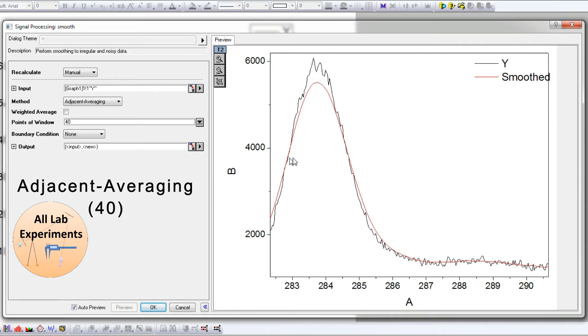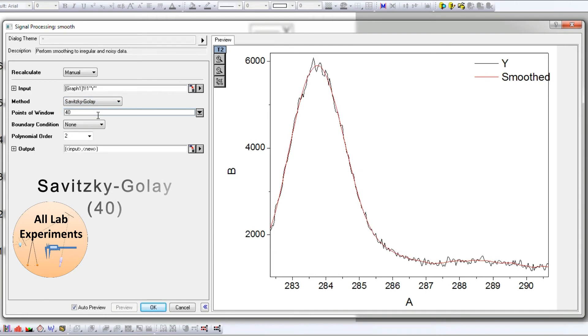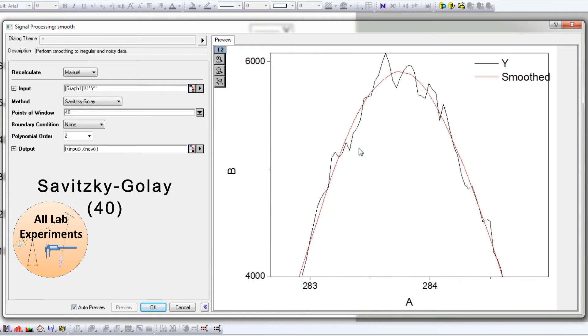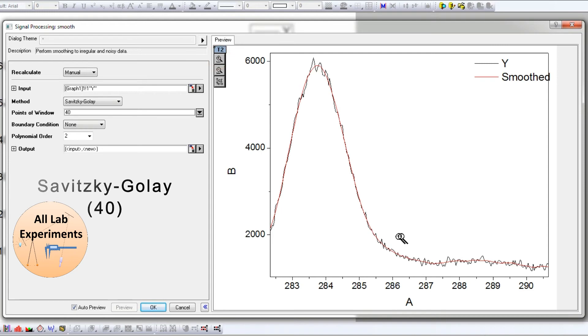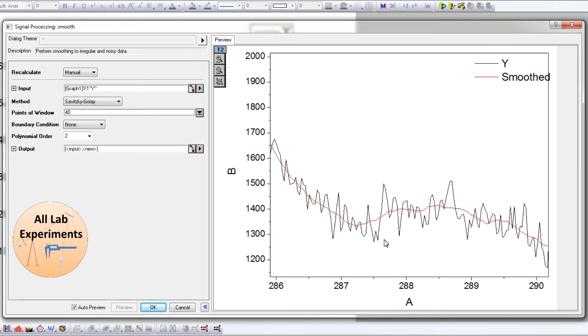In the case of Adjacent Averaging, you will see that the peak height is not the same. Therefore, the FWHM of this peak will also change, so this kind of smoothing is always unacceptable. Now let us try the Savitzky-Golay option. In this case, you will find that this peak is absolutely fine. The peak height and FWHM nothing is changing, and in the second region as well it is keeping the maximum information.